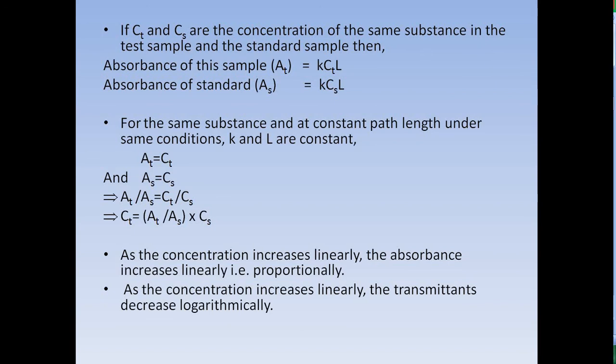As the concentration increases linearly, the absorbance increases linearly, that is, proportionally. As the concentration increases linearly, the transmittance decreases logarithmically.